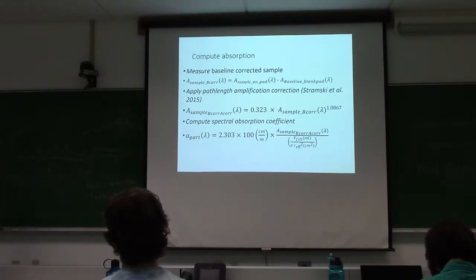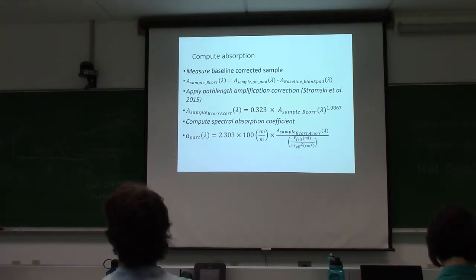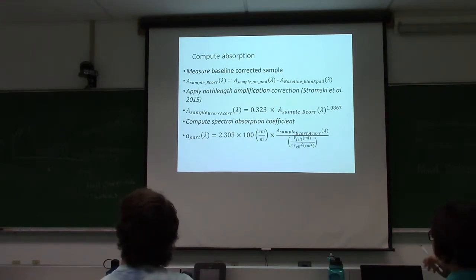The problem is, what happens if you don't have phytoplankton? What happens if you have non-algal particles? So here's what the absorbance by non-algal particles looks like in a center-mounted integrating sphere, they actually do have some absorption. And so if I measured this in transmission mode, how much do I subtract? Because I don't have the white curve. I don't know how much to subtract. And so the full thing gets subtracted in the null correction. And you end up underestimating absorption.